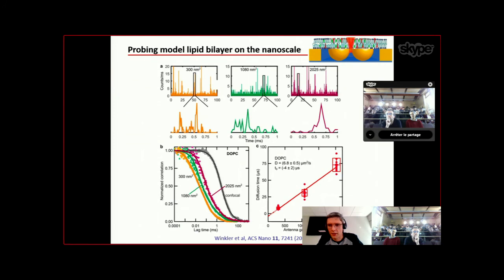this fluctuation can not only be related to blinking, to an intersystem crossing, but it can also be due to some fluctuation in the orientation or position of the dye. Because this is so sensitive, especially to orientation, if the molecule turns by 45 degrees, it's going to have a huge influence on the net fluorescence signal. So not all blinking is related to photokinetics. It tells you something about the molecule, of course, but it's not only affected by the photokinetics.